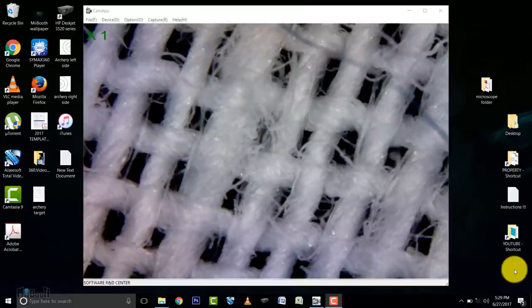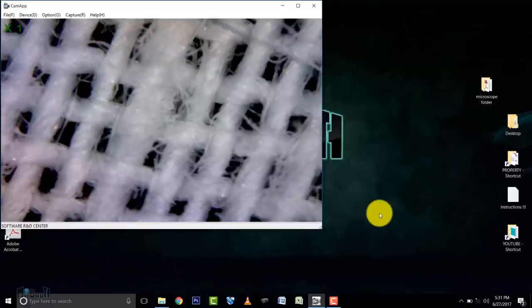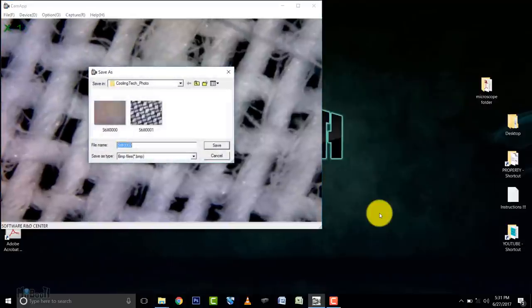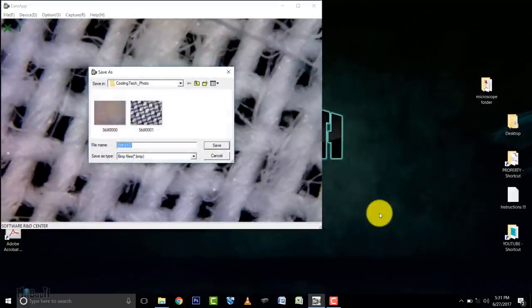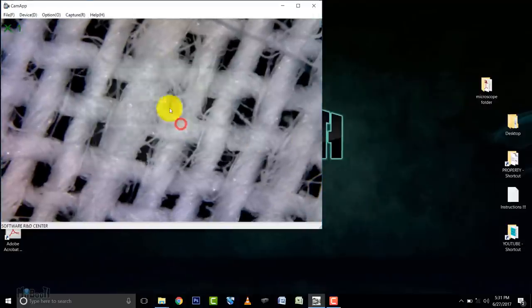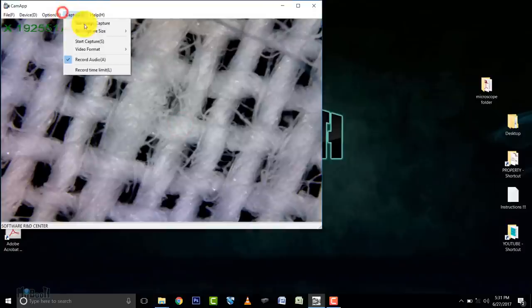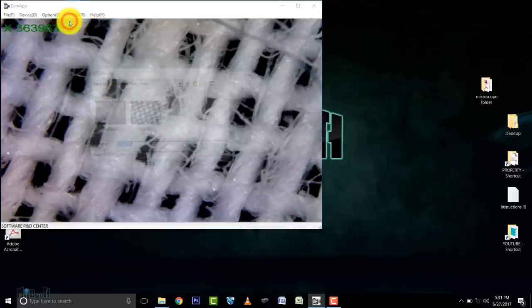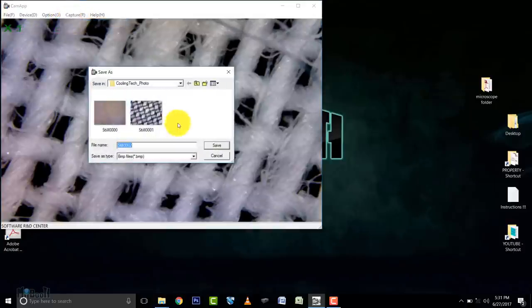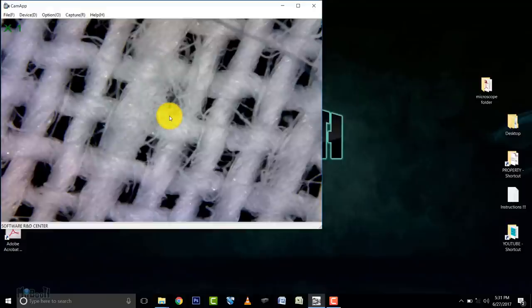At this point you can take a picture by simply pressing the snap button on the microscope, or by going to the capture tab in the software and clicking on still image capture. You can save it wherever you want. I choose to take pictures from the software because I fear pressing the snap button on the microscope might shake it.